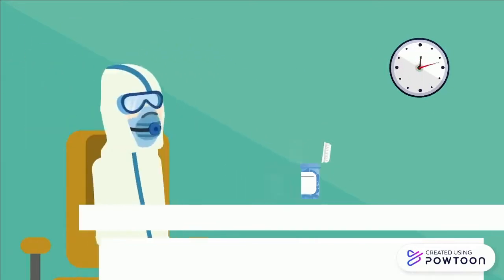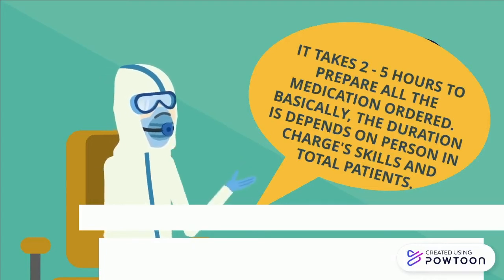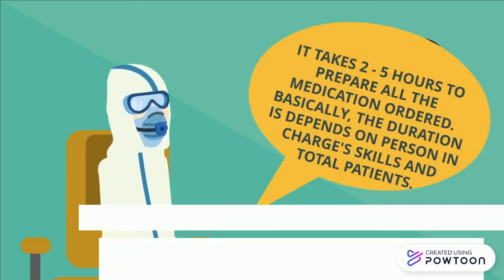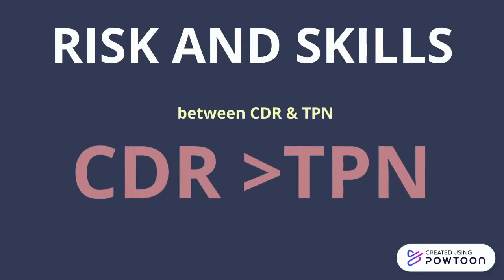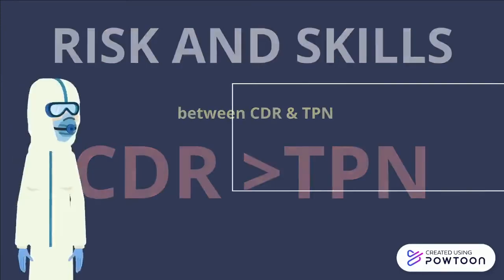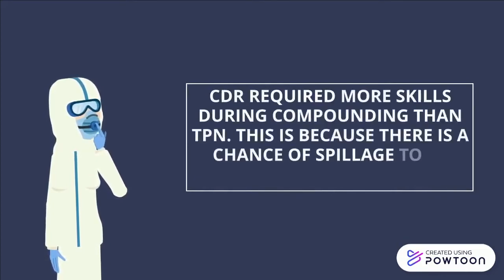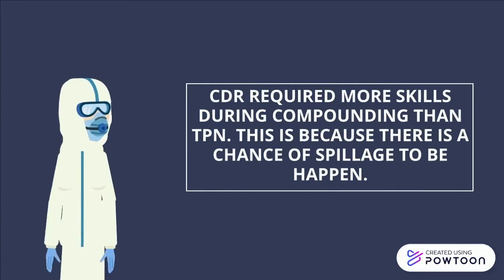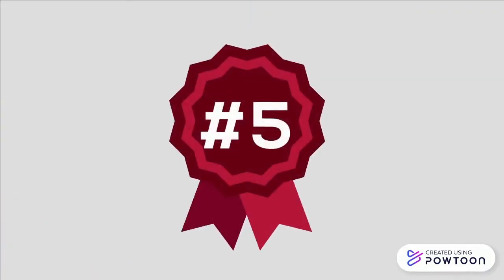It takes 2 to 5 hours to prepare all the medication ordered. Basically, the duration depends on the person in charge, skills, and total number of patients. CDR requires more skills during compounding than TPN. This is because there is a chance of spillage happening.